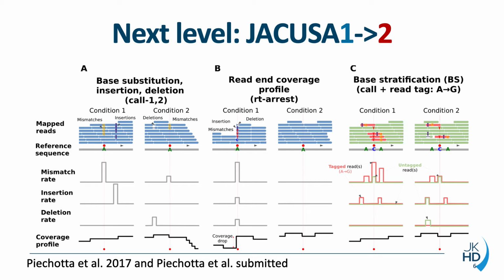So here essentially we look at piles of reads again in a comparison across two conditions, and we are asking whether any coverage drop that we observe at a given particular position is significantly higher than you would expect by chance, using again a principled statistical modeling approach, the beta binomial distribution, as the underlying modeling framework.